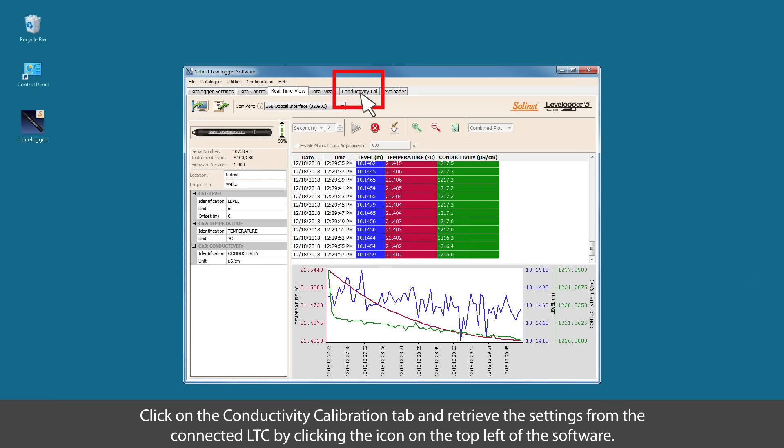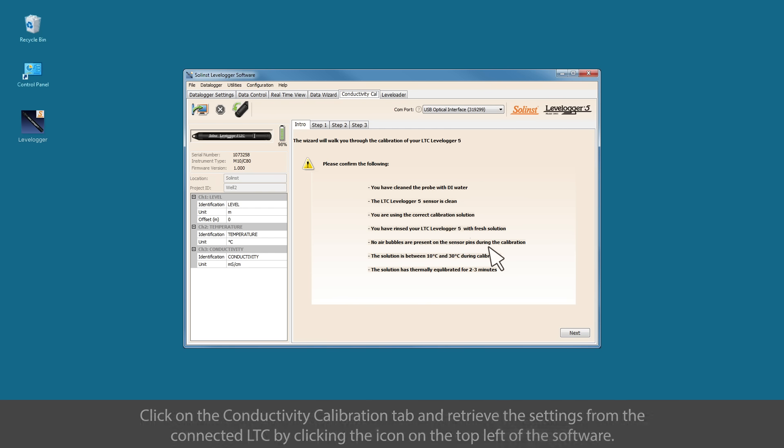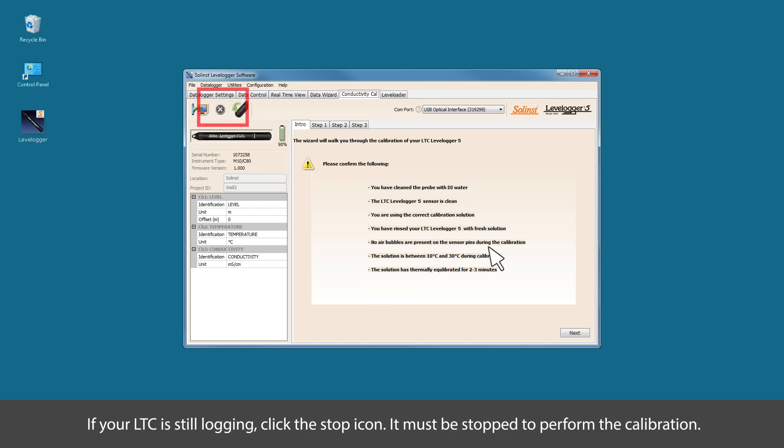Click on the conductivity calibration tab and retrieve the settings from the connected LTC by clicking the icon in the top left of the software. If your LTC is still logging, click the stop icon. It must be stopped to perform calibration.